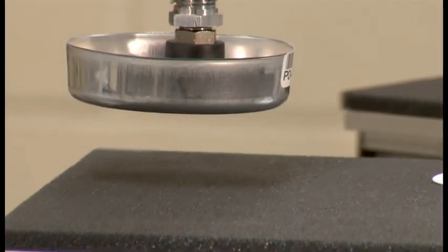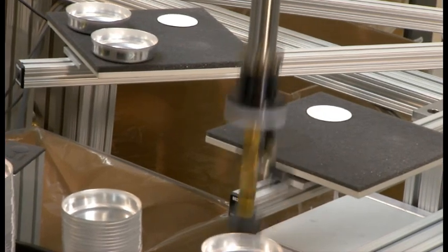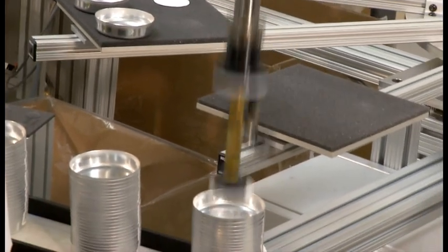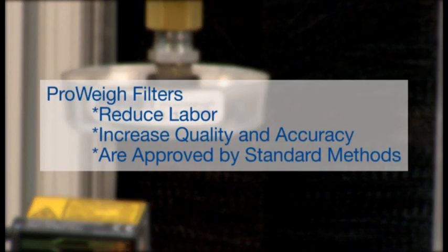After 25 pans are stacked together, an empty pan is added as a dust cover to keep the top filter free of particles. Filters are now ready for analysis.